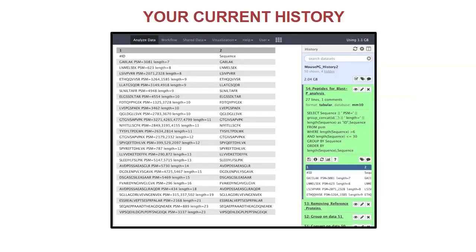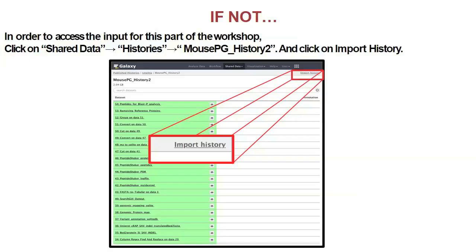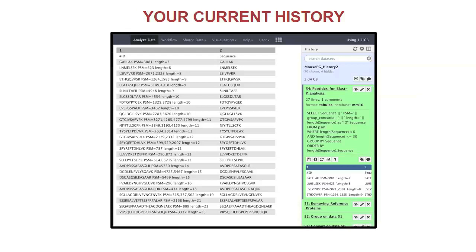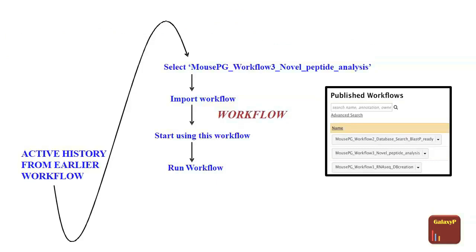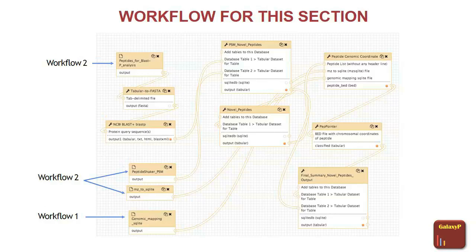The third workflow. By the end of this, your history would look like it has 54 items — outputs from each of the tools. As a backup in case your search stalled for some reason, you can always go back to that Galaxy instance and download the history for the third workflow. The third workflow takes inputs from workflow 2: the BLAST-P peptides, the PSM report from Peptide Shaker at one percent global FDR, and the MZ2 SQLite file.